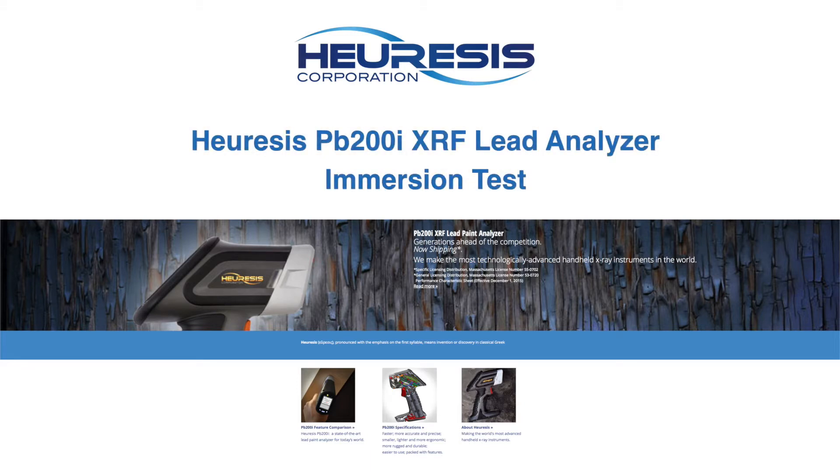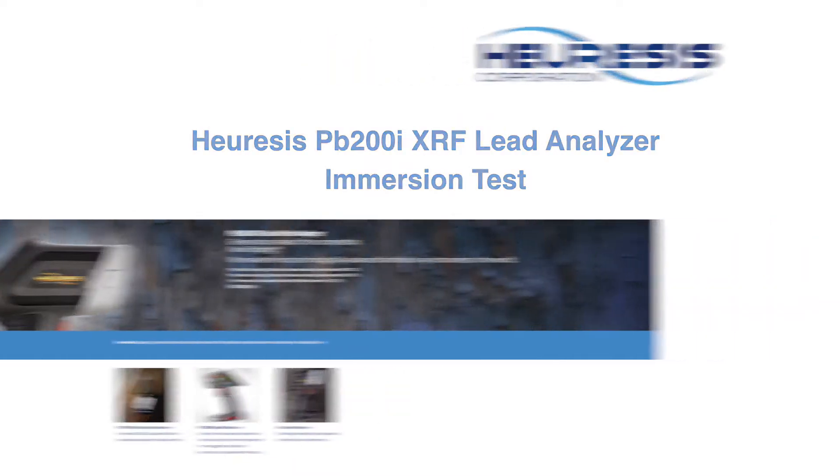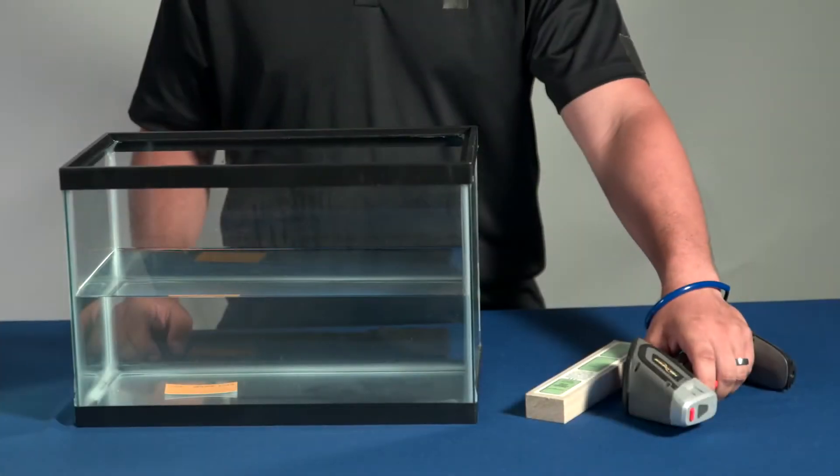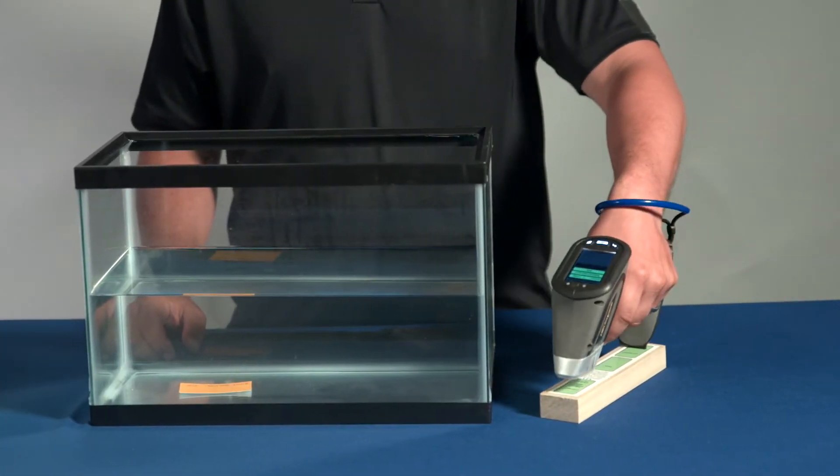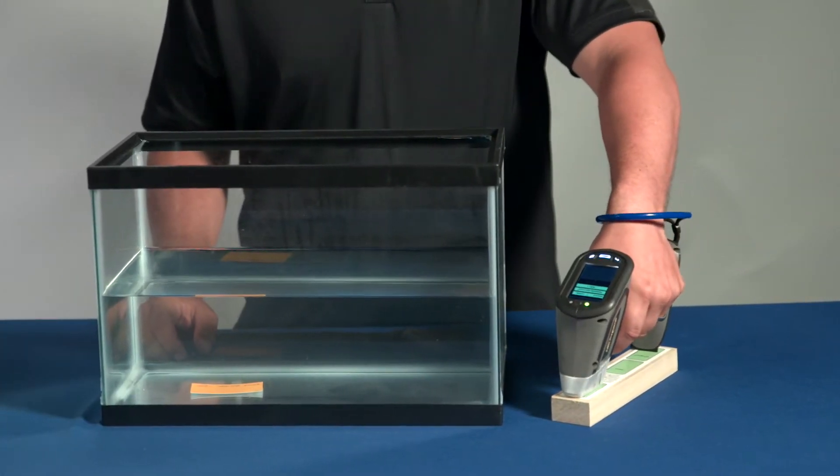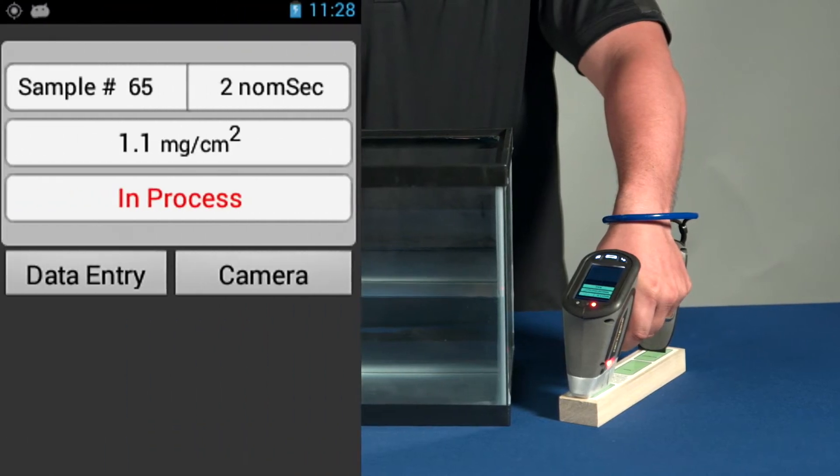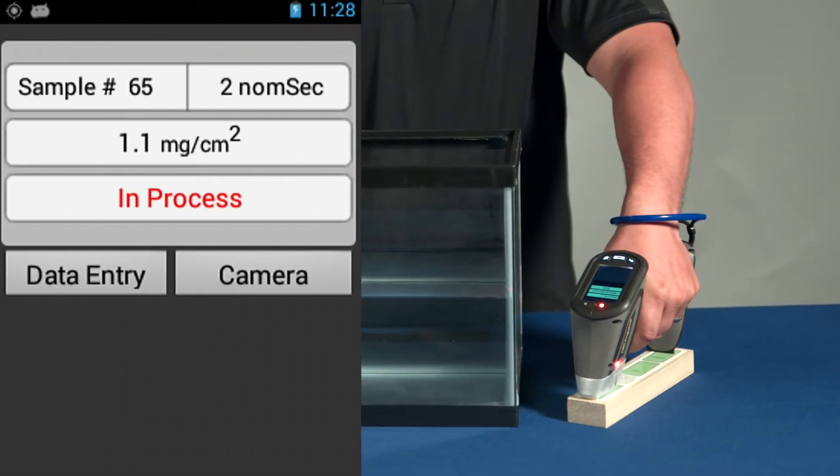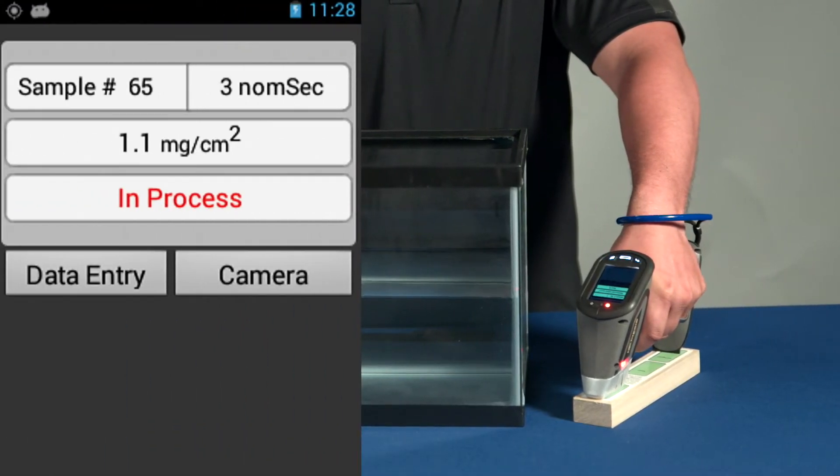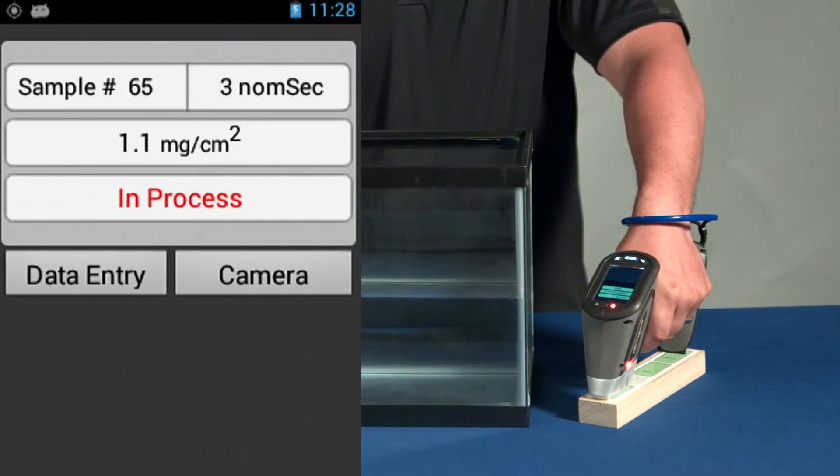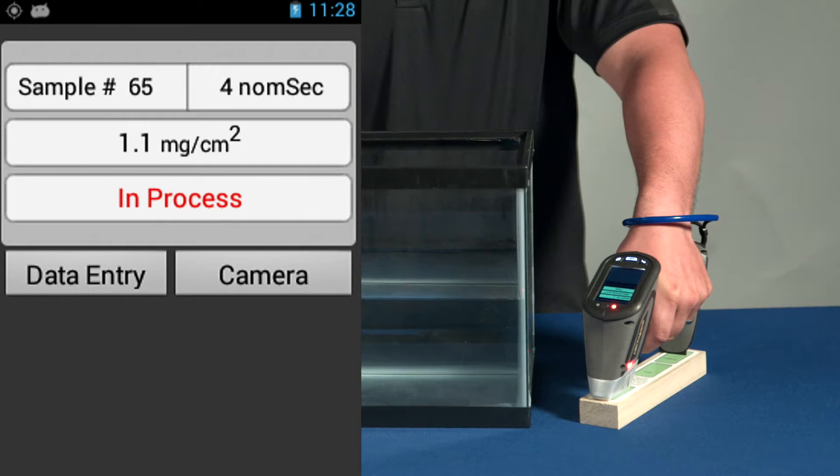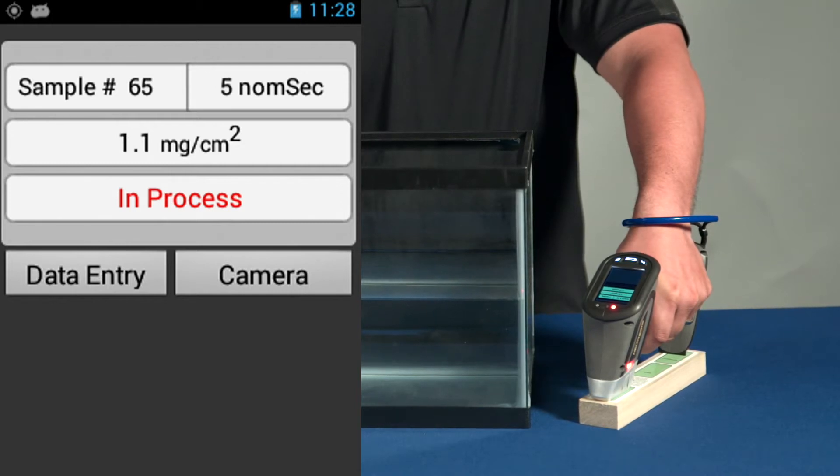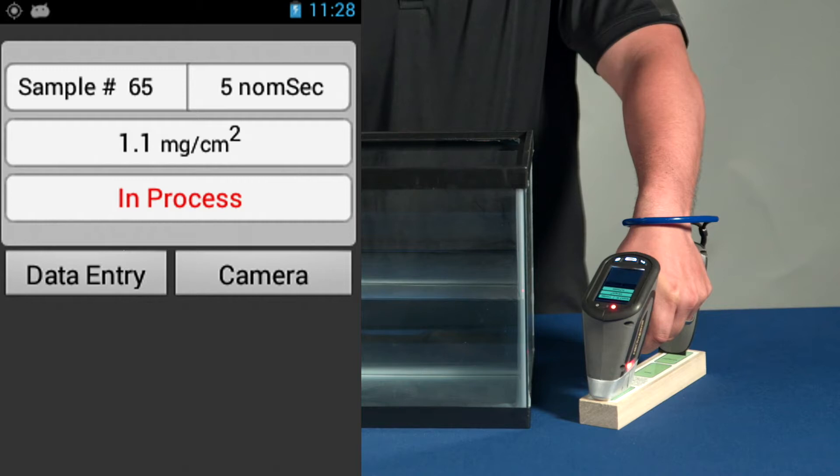The Heuresis PB200i is IP65 rated and splash proof. We're going to show the instrument working on our NIST certified reference standard, the 1.02 milligram per square centimeter, where we're required to take three measurements between 0.8 and 1.2 to show that the analyzer is in control.